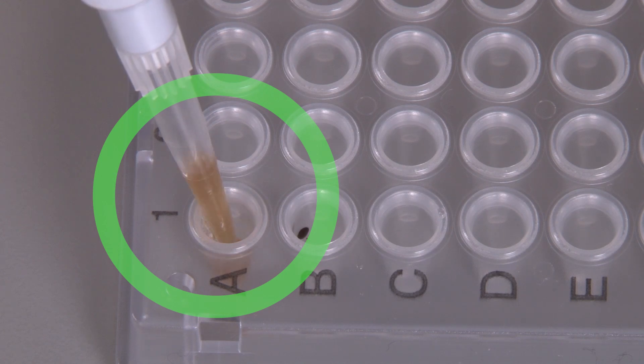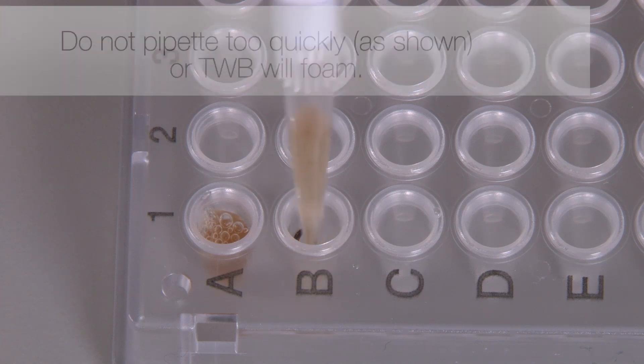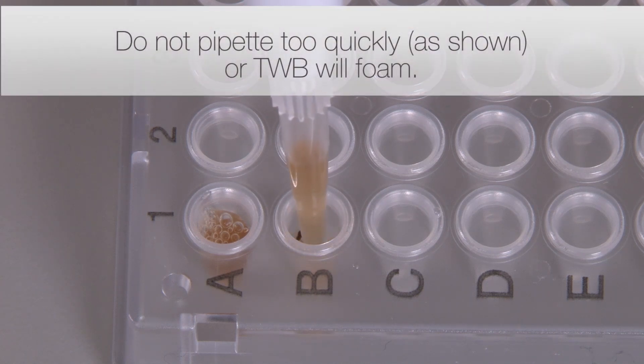Use a deliberately gentle pipetting technique. Pipetting too quickly can cause the TWB to foam.